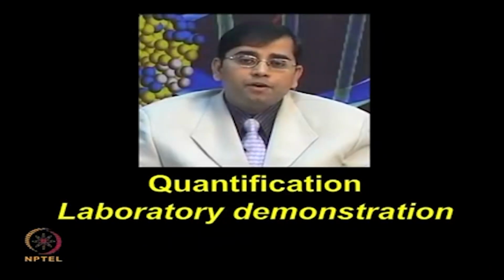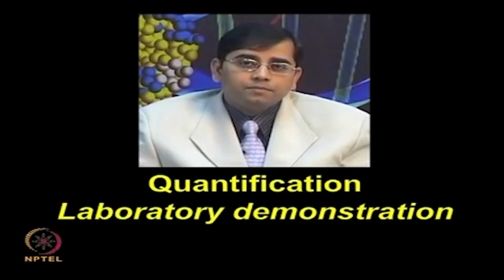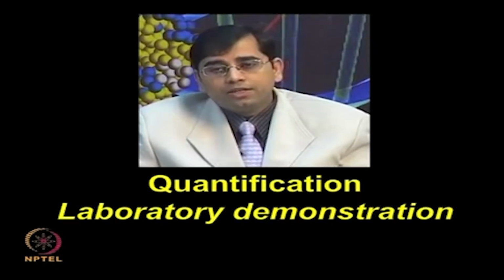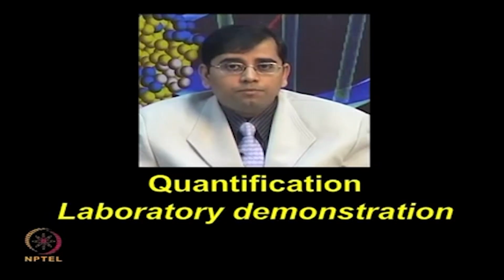So, how to perform the quantification? Let me show you one video, a laboratory demonstration of how to perform protein quantification.